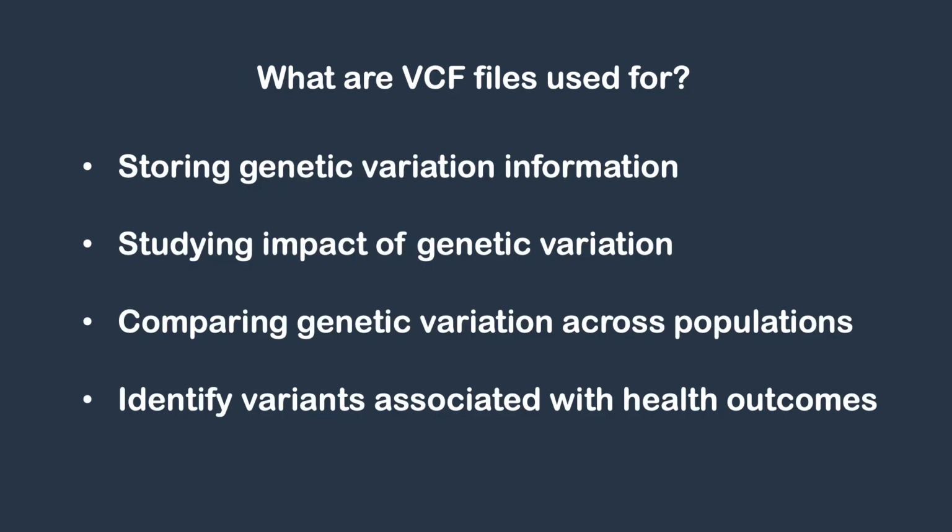So what are VCF files used for? They're used to store genetic variation information, and we can use this information to study the impact of those variations on things like gene expression, to understand the prevalence of variants across different groups or populations, and to identify variants associated with human health outcomes, among many, many other use cases.